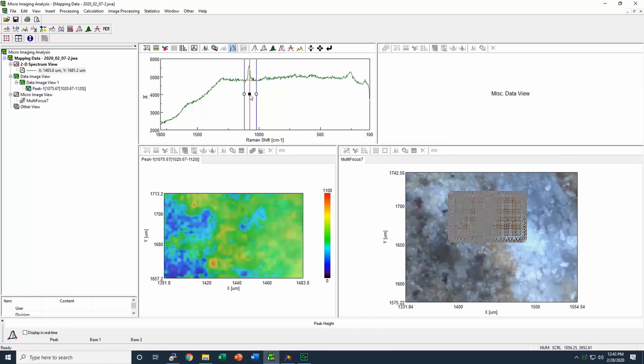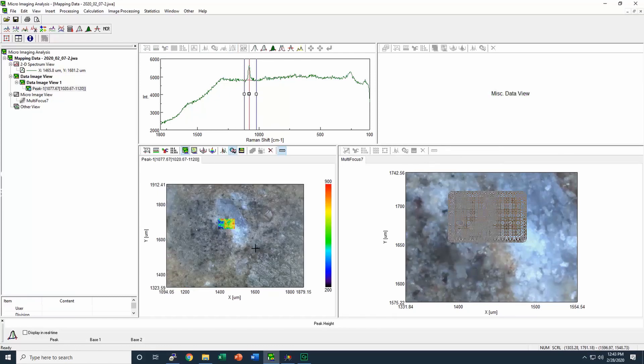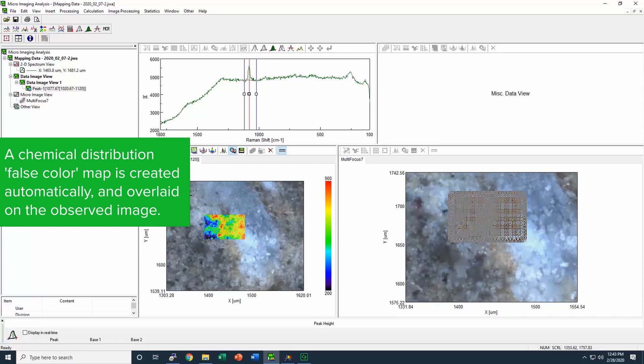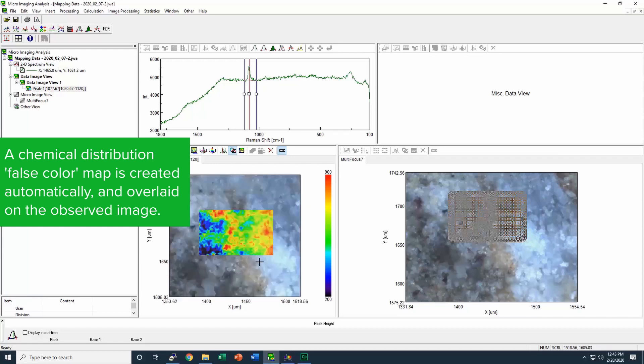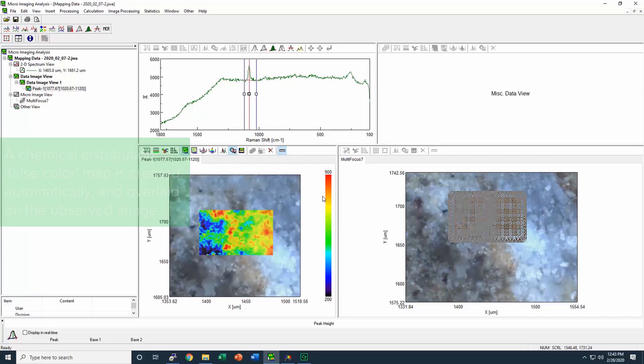Once the false color map has been laid over the top of the all-in-focus image, you can zoom in or out to find the exact location of that material in your sample.